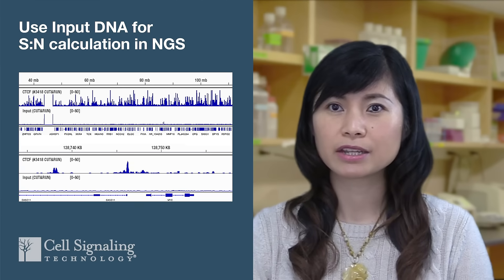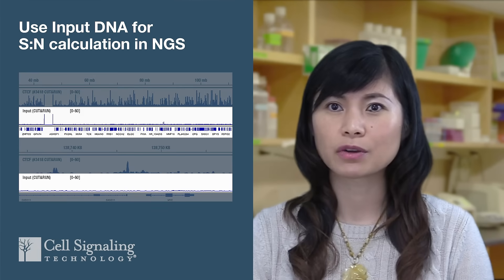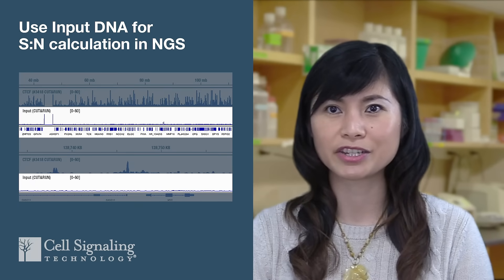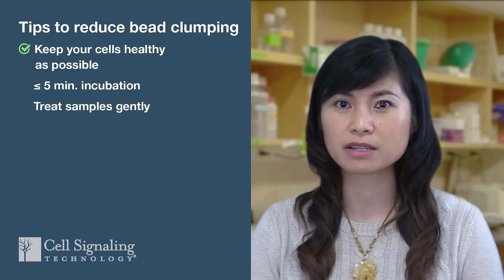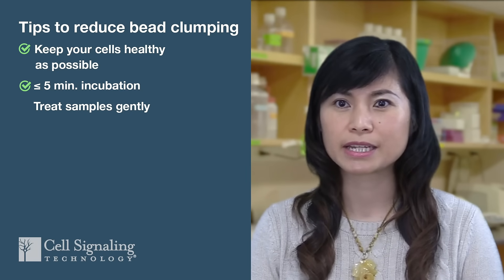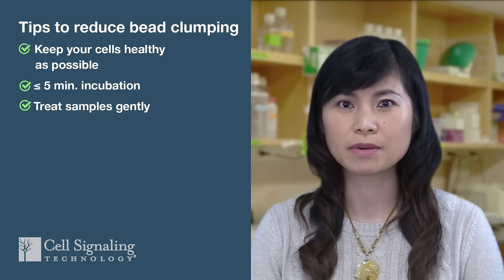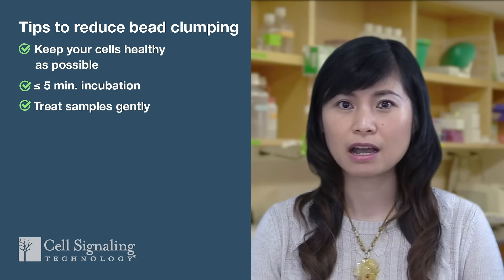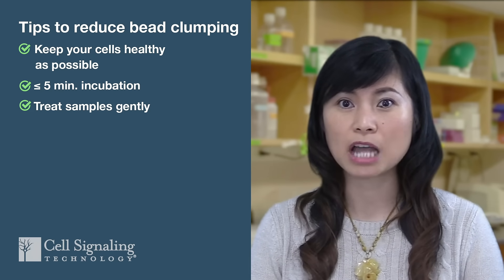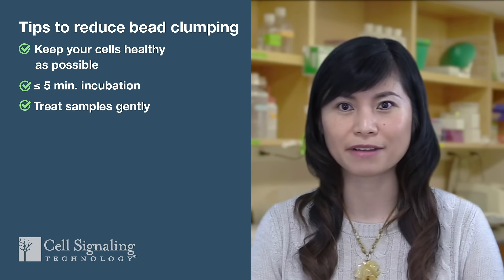For NGS analysis, include an input DNA control for signal-to-noise measurement. Input DNA is more diverse and has lower background in NGS compared to an IgG control. In CUT&RUN, concanavalin A-coated magnetic beads are used to isolate the permeabilized cells. Beads can aggregate or clump together if the cells are undergoing lysis rather than just being permeabilized. Make sure your cells are as healthy as possible before starting the protocol. Incubating cells with beads for no longer than 5 minutes and treating samples gently during the cell wash steps can help reduce bead clumping. That said, our internal testing results have shown that bead clumping does not negatively affect the final results of CUT&RUN experiments.